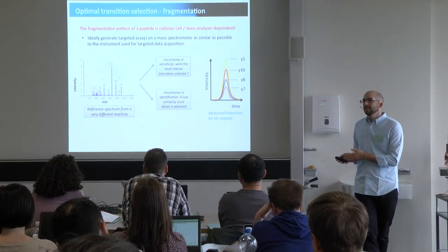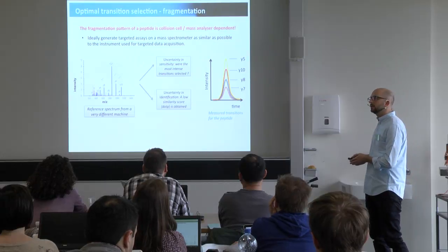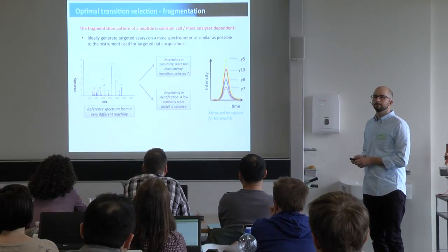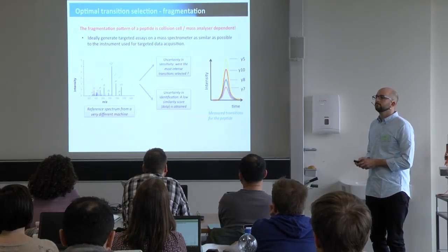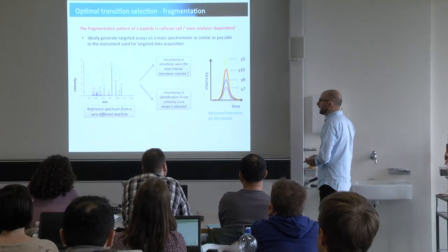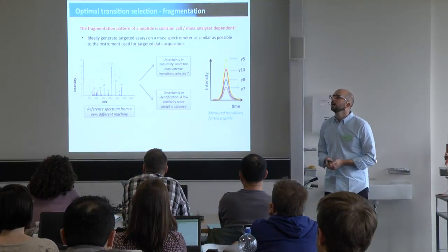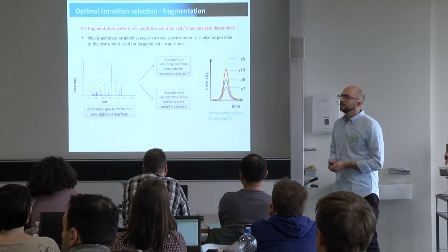Does anybody have an idea what could help us with a situation like this? We mentioned it in the first talk by Tina. What was the 6th criterion? Retention time could, yes, but sometimes I don't have retention time, so without synthetic peptide.